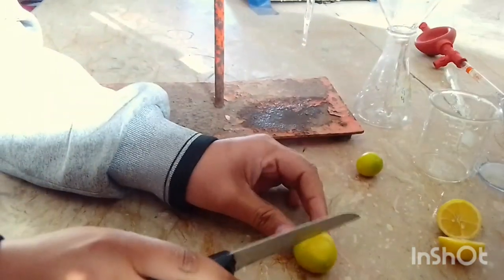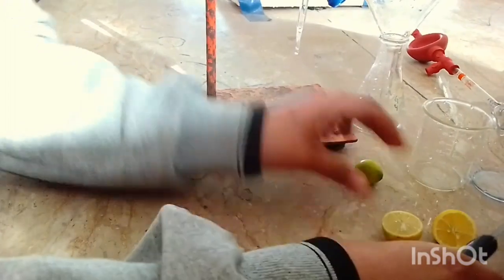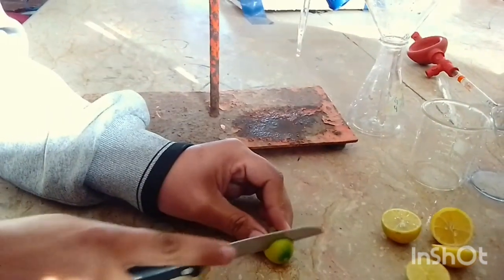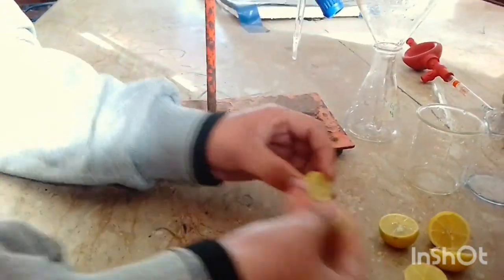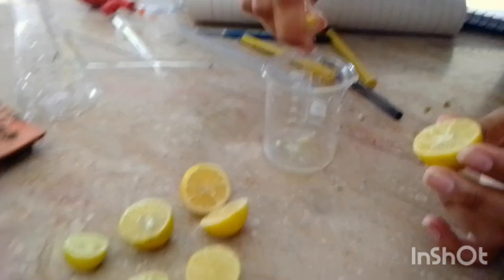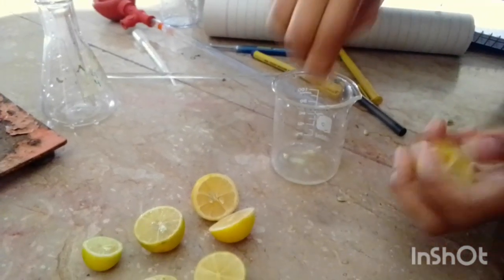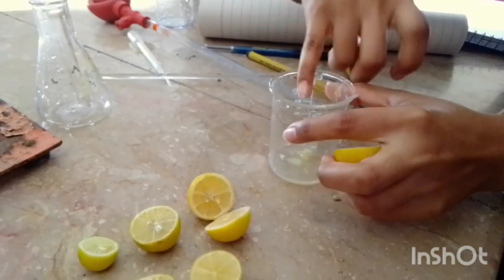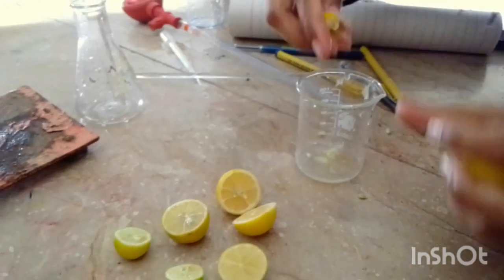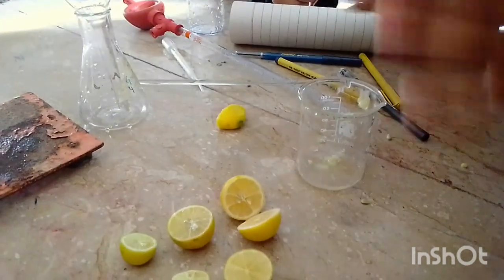For this we need fresh lemons. We are cutting the lemons into two pieces because we need the extract. Now we are squeezing them to get the extract of the lemon.